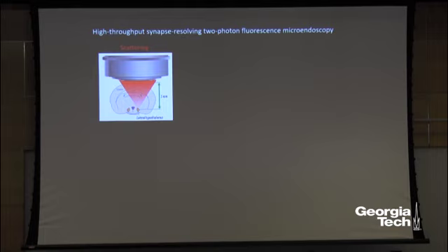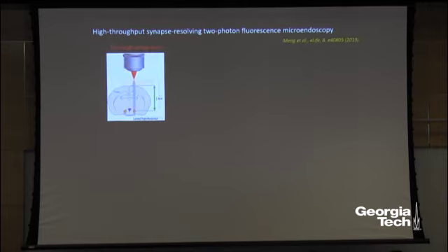So I just want to quickly, before I move on to the next data set, say that obviously there's a problem when you want to image very deep structures in the brain that is opaque, is that the optical scattering will just kill all your signal and your excitation. So you can't really image using a conventional method a structure that is 5 millimeters down inside the brain, or even, without using 3-photon, 1 millimeter down in the brain. Now, one of the methods that can allow us to do that is to use what we call a GRIN lens. So it's basically a very miniature optical component that can image the focal plane of a conventional microscope objective onto the sample. So like an image relay.